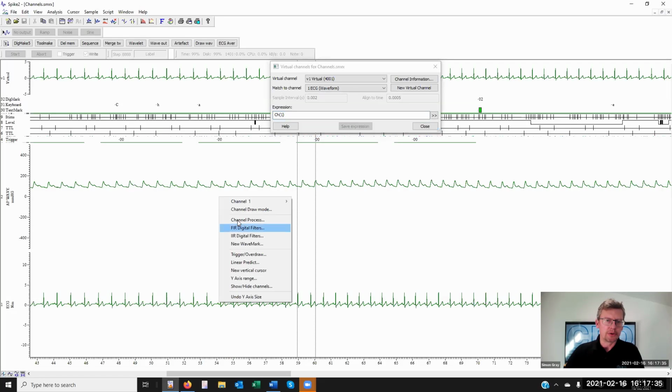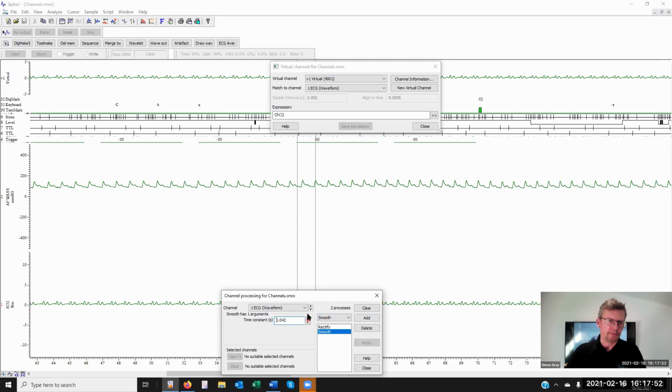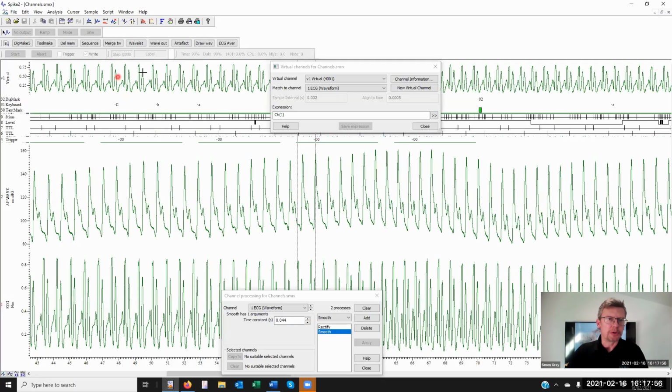If I channel process the original, perhaps by, yes, let's rectify, add, you'll see that the virtual channel is updated. If I smooth, you can see that the virtual channel is following suit. Okay, so the virtual channel, again, calculated, changing, recalculating as the source data changes.